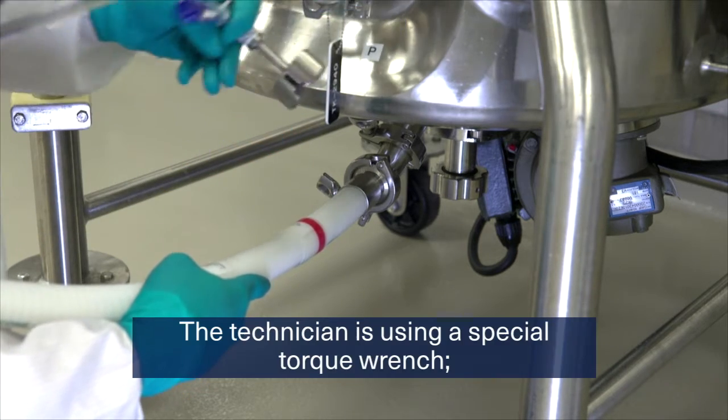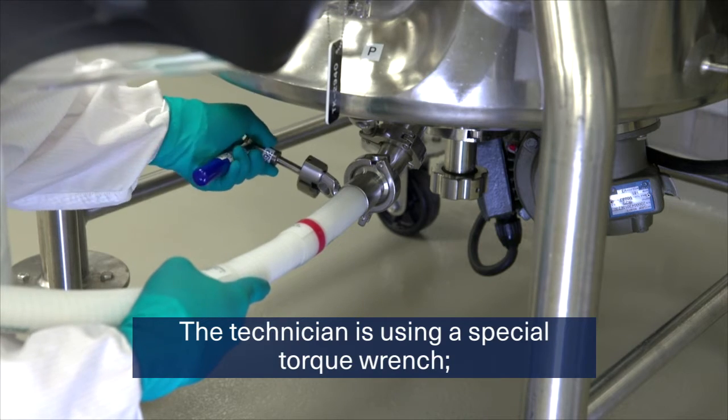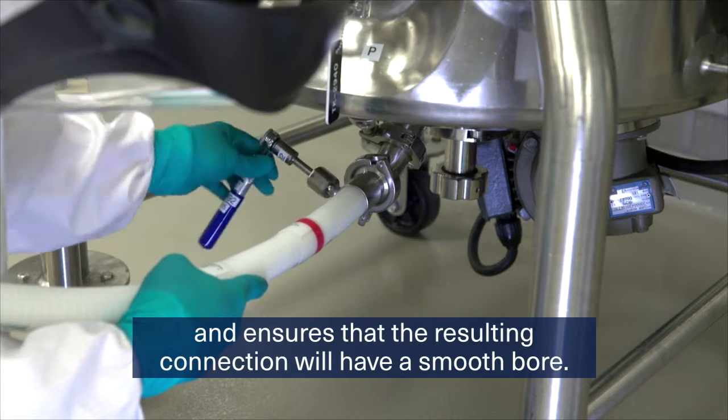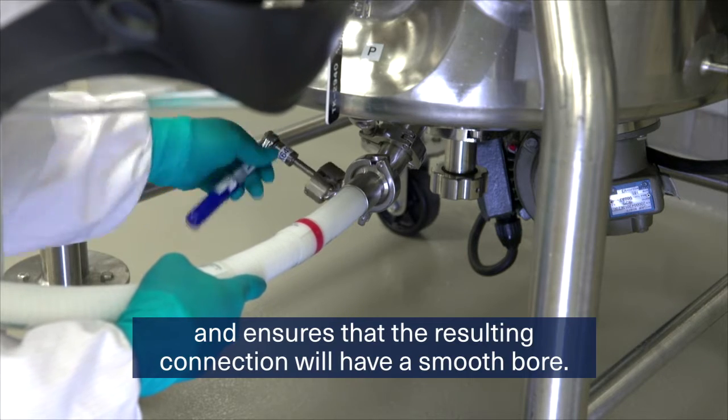The technician is using a special torque wrench. This improves the ergonomics of the activity and ensures that the resulting connection will have a smooth bore.